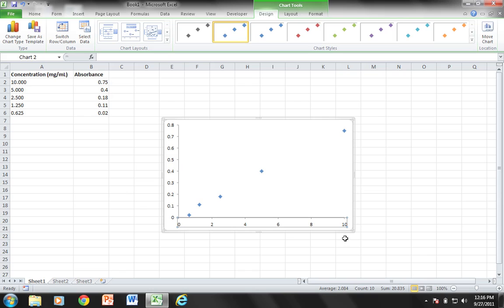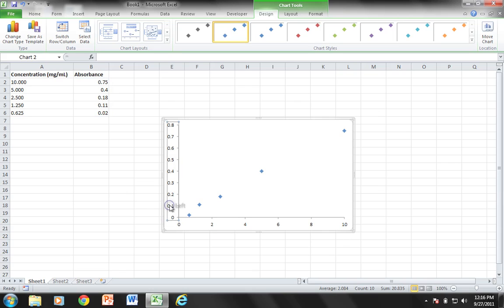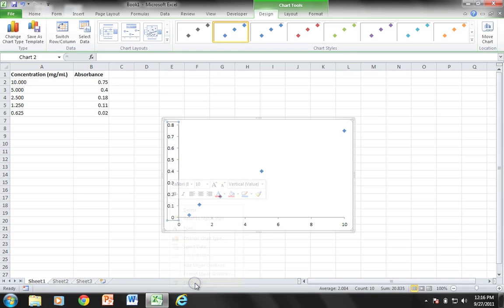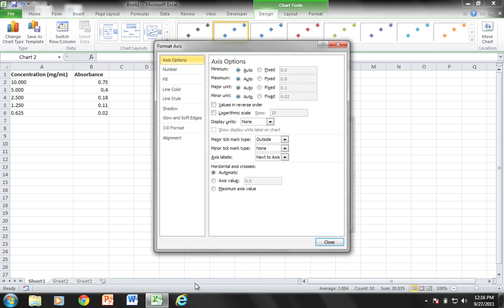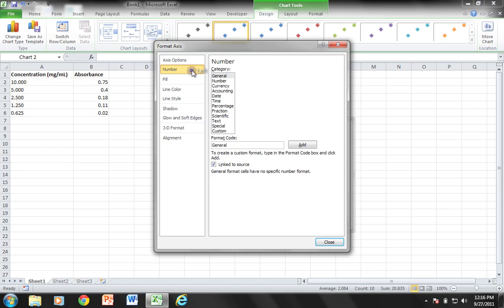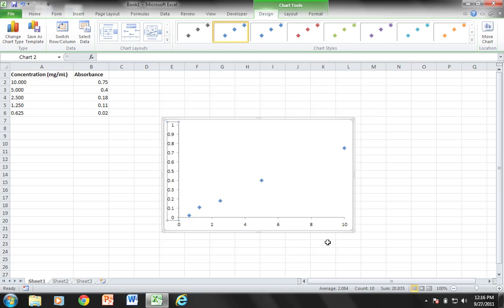That is my new axis. I'm going to come and do the same for the y-axis. Right click, format axis, and my fixed value for my maximum I'm going to change to 1.0. I'm going to do major units of 0.1 and then my number will be just general.